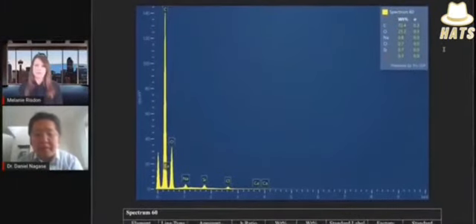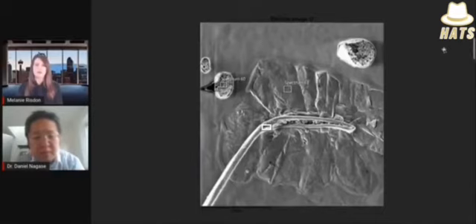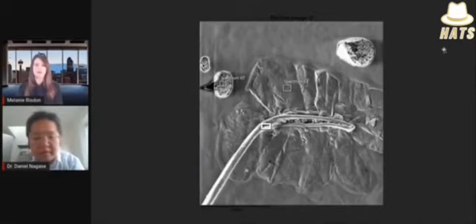So spectrum 60 is one of the balls that wasn't in that folded part. Spectrum 61 is the crystal. Spectrum 62 is the folded over part of the shaft and maybe one of those little round balls, but we'll see more of those later.